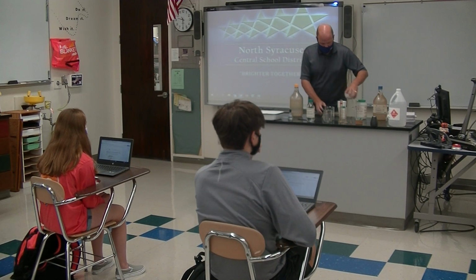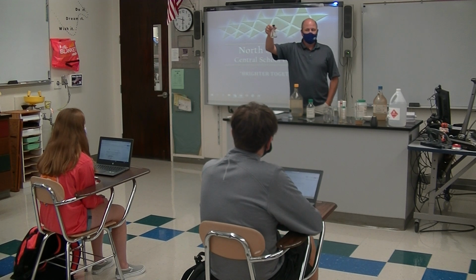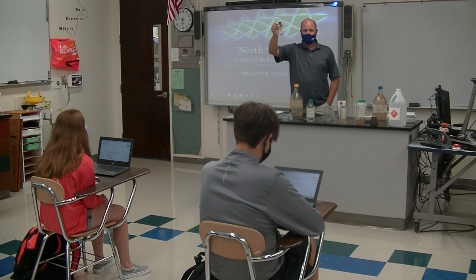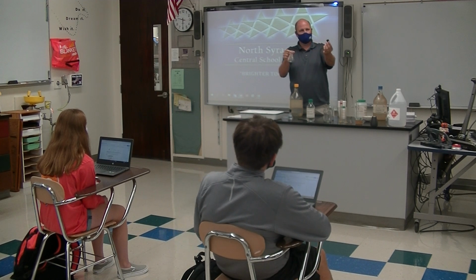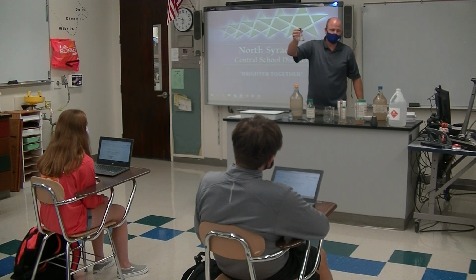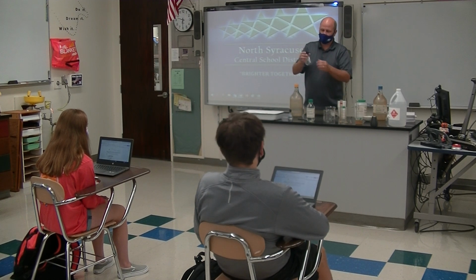Let's see, what else did we not cover? This one we didn't cover. Have you ever seen one of these things before? This is called an Erlenmeyer flask. We use them in chemistry all the time because we can put one of these on them. These are called stoppers. It's a rubber stopper that goes on the top. A flask is just something that carries a liquid. A beaker is not really a flask, it's got a separate name. But the flask carries liquid and we can cover it.